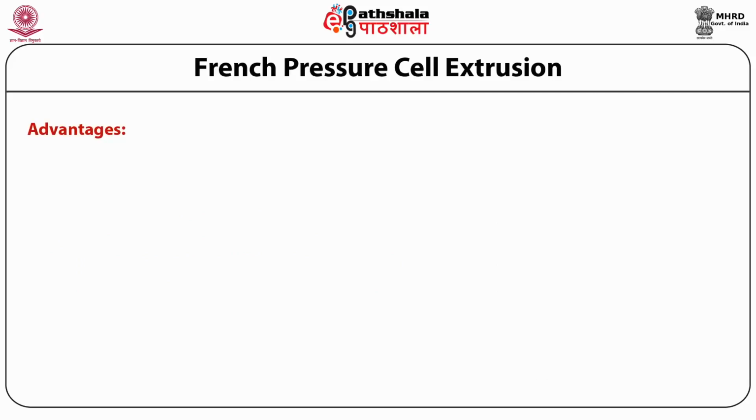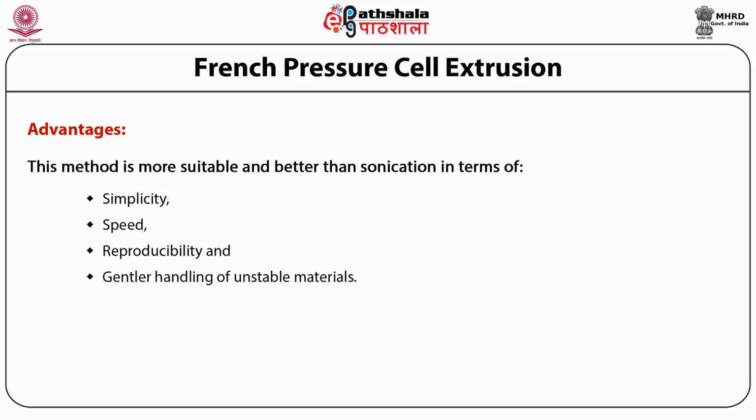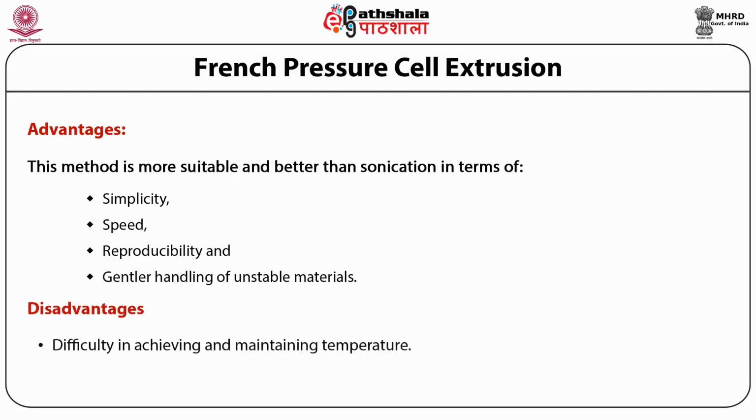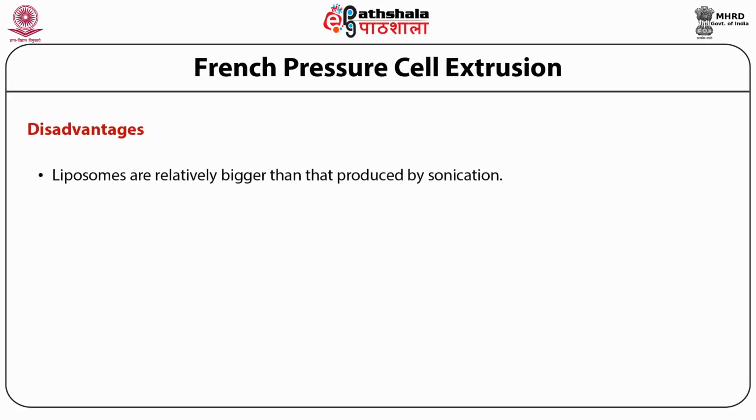Advantages of this method: the method is very simple, speed is very high, reproducibility, and gentler handling of unstable material. Disadvantages of this method: difficulty in achieving and maintaining temperature. Second, relatively smaller working volumes, maximum 50 ml. Another disadvantage: liposomes are relatively bigger than that produced by sonication.